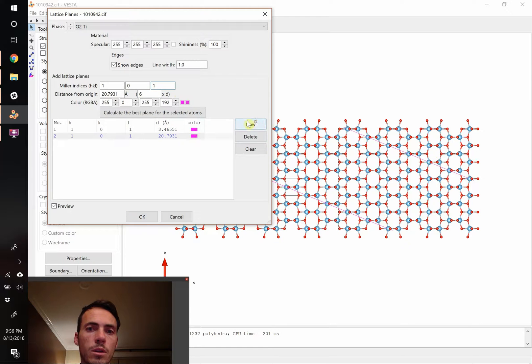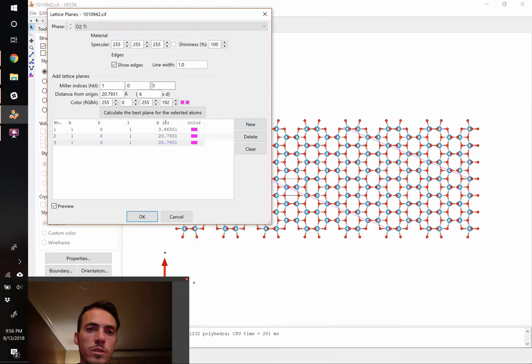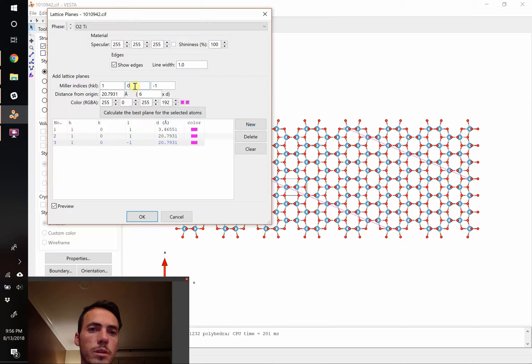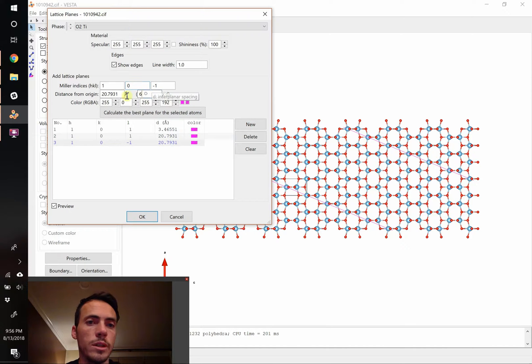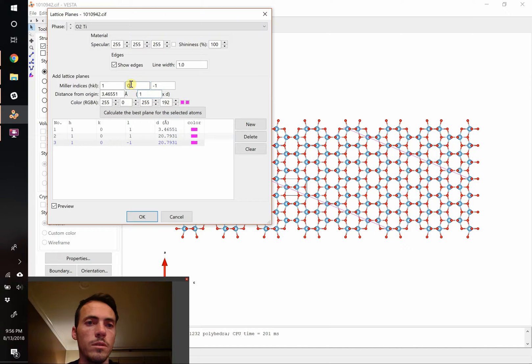Now we're also going to add another one. This is going to be the 1, 0, minus 1 plane, in the same family of the 1 and 1s. This one we're going to do with the D spacing of 1. So that should show up there.